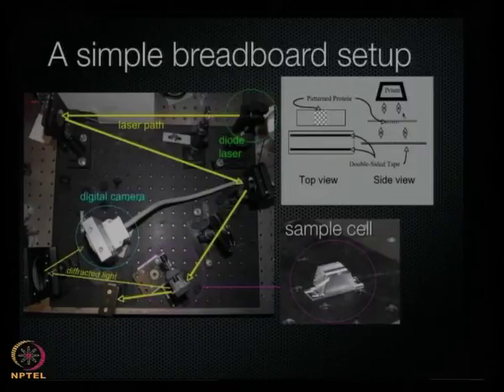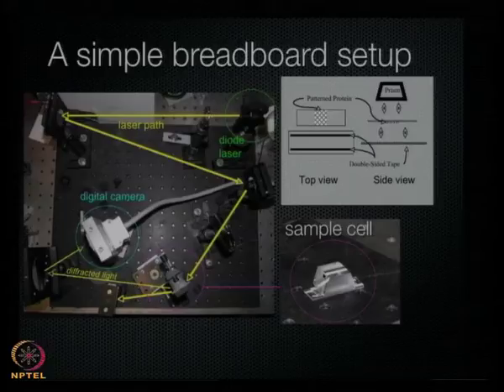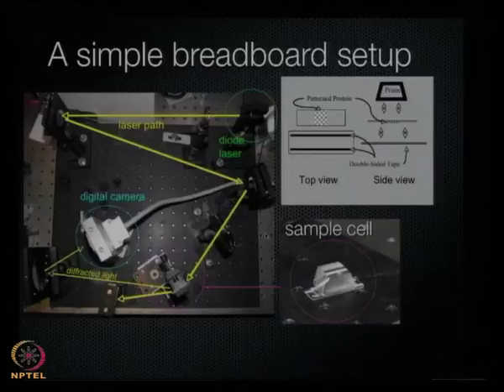Right. And on the other side, we put in a prism. The prism helps to guide the light so that we're under what's called total internal reflection. So the light doesn't go all the way through, it just skims the surface and actually detects the binding on this upper substrate. So it's very simple. So when you have a prism, then you have the matching fluid for refractive index correction. Then you have the slides which contain the protein. That's right. And then with the light beam, you are initiating diffraction. Yeah, and with this simple assembly, you can actually measure down to nanograms per milliliter, label-free.